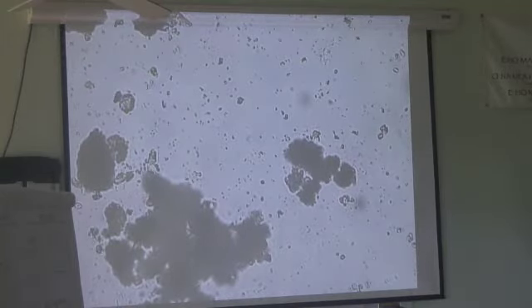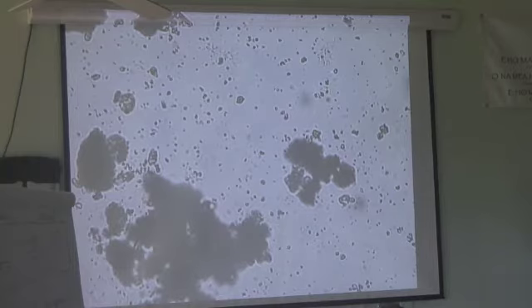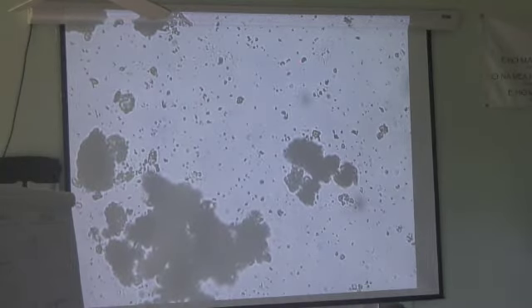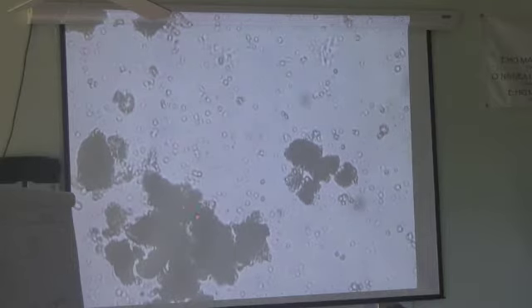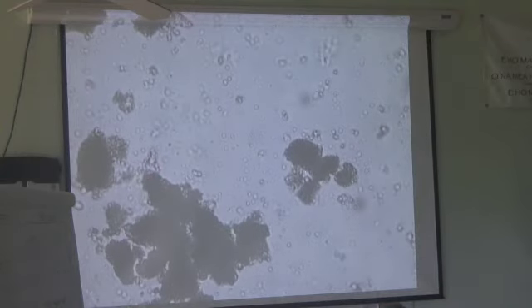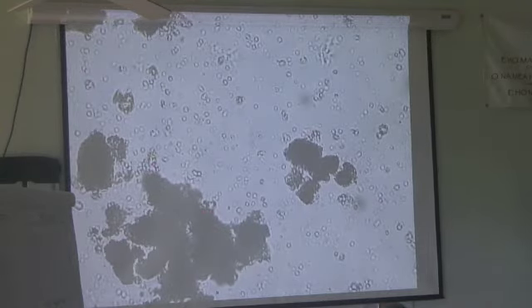So that was field number five or four? Four. Four, so we'll go a little more. Just looking for movement. Maybe that's an amoeba. Nope. See any strands of anything? No, not seeing any strands. So you see why we go through a number of fields. Flagellate, there he goes. Actino, there's a real skinny one right there.